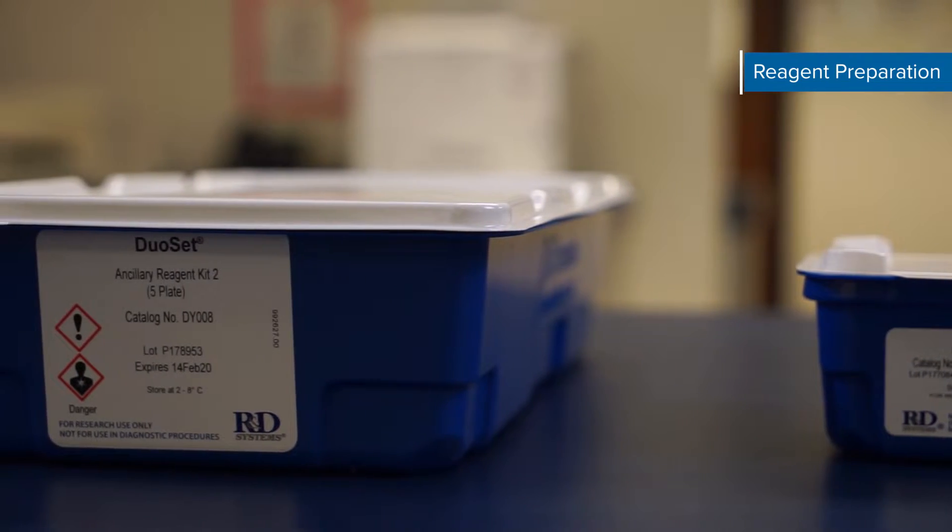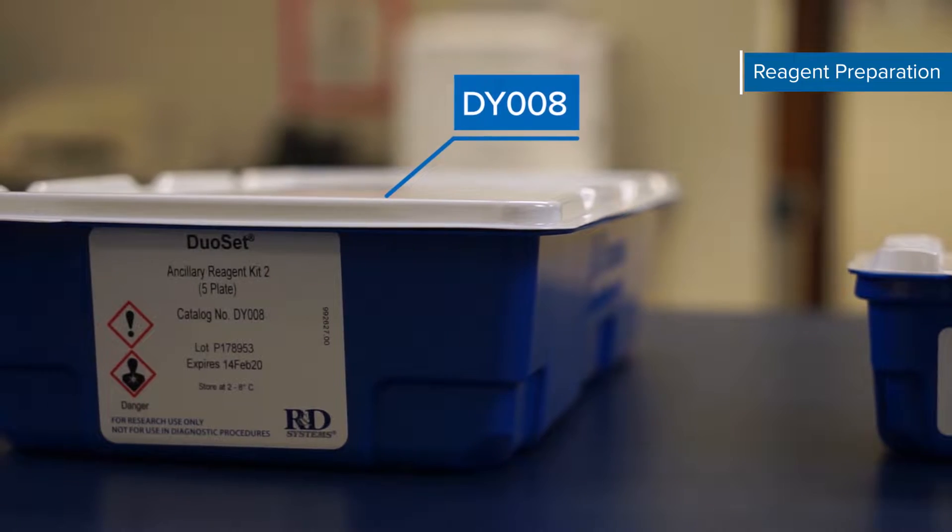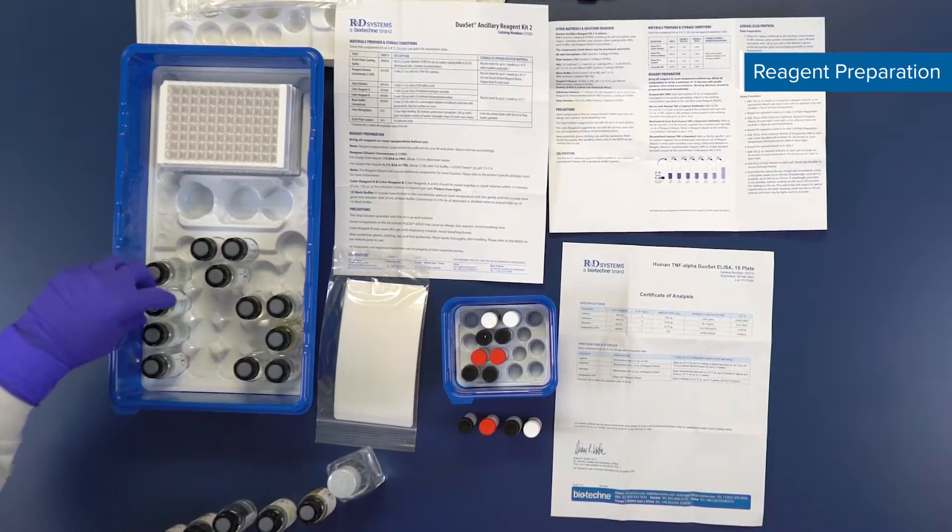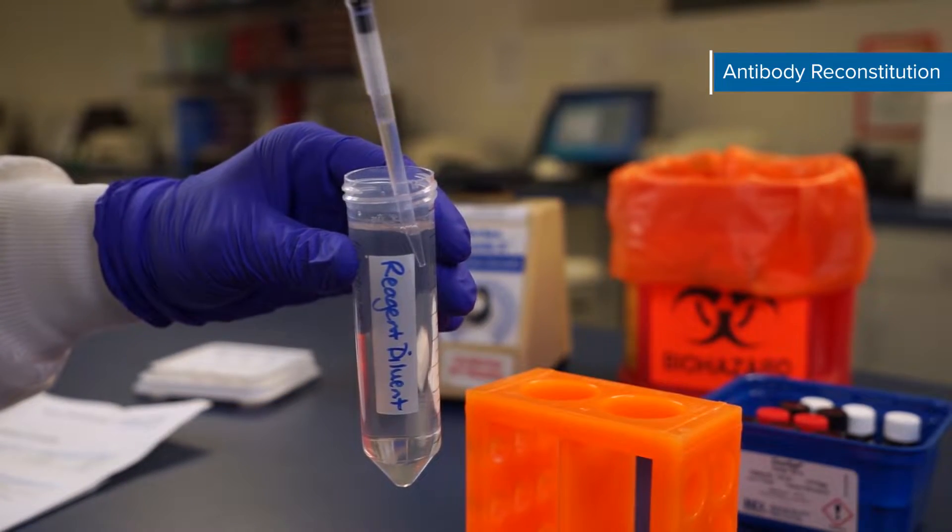For this assay video we will be using the recommended Duoset Ancillary Reagent Kit 2, catalog number DY008. This kit provides enough components to run five 96-well assay plates.